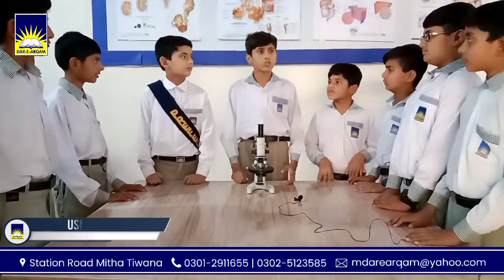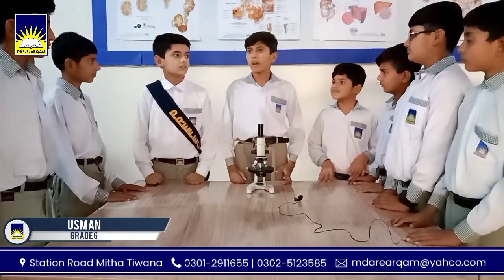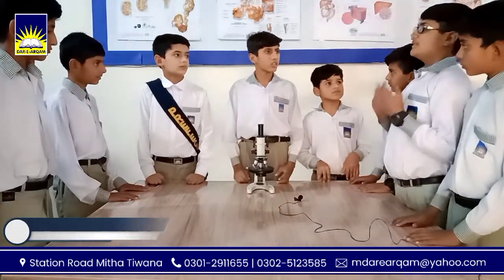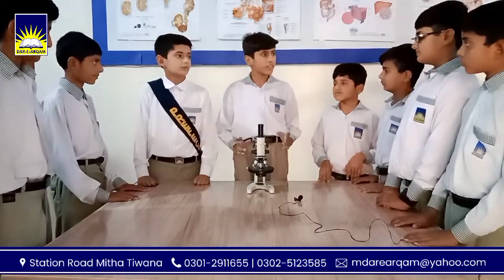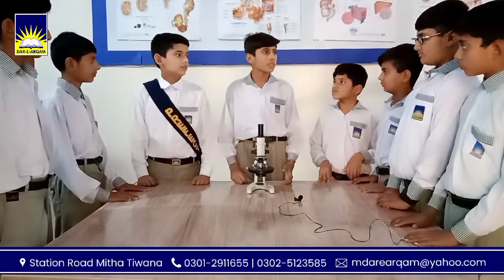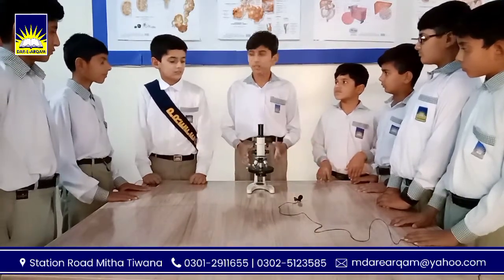Today I am going to tell you about microscope. Do you have any information about microscope? Yes, I have. What is microscope? Microscope is an instrument which is used to see small things. Yes, you are right. A microscope is an instrument which is used to see very small things that cannot be seen with naked eye. We can look at something through microscope.